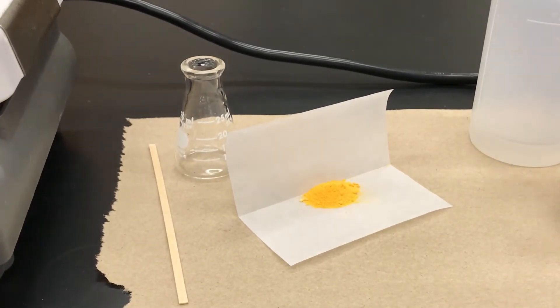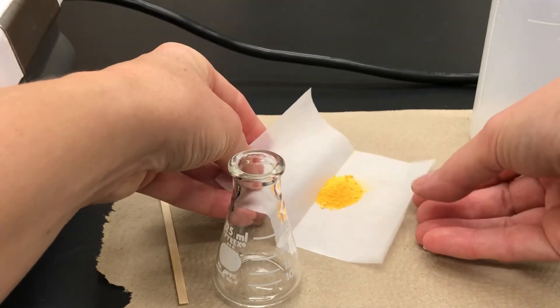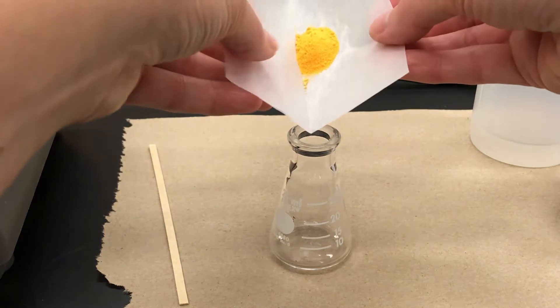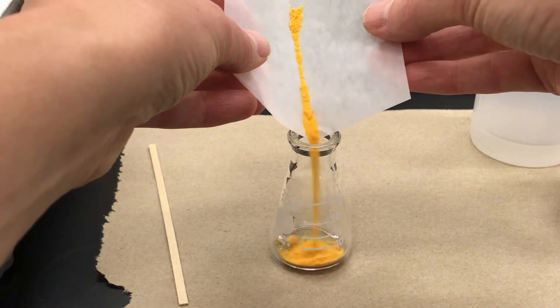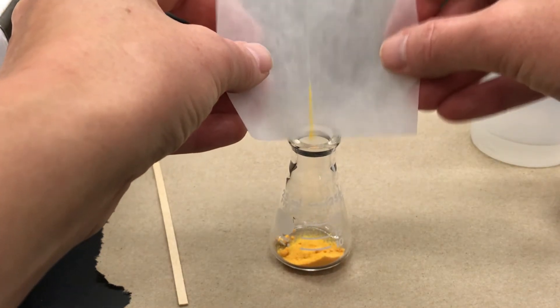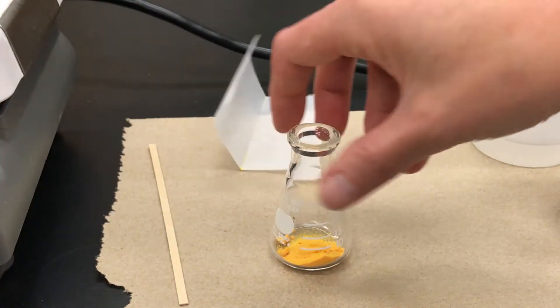Next, to be ready, I'm going to put my impure solid into this little Erlenmeyer flask. I've weighed it out on some glossy weighing paper, which means it's going to slide pretty easily into the flask. You want to use the right size flask for your crystallization, and that sometimes takes some experimentation to figure out what's right for the scale you're using.